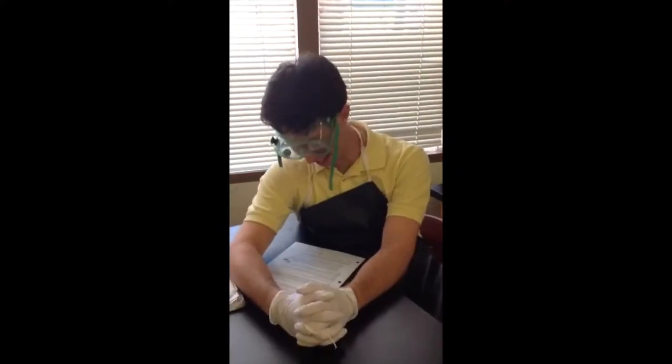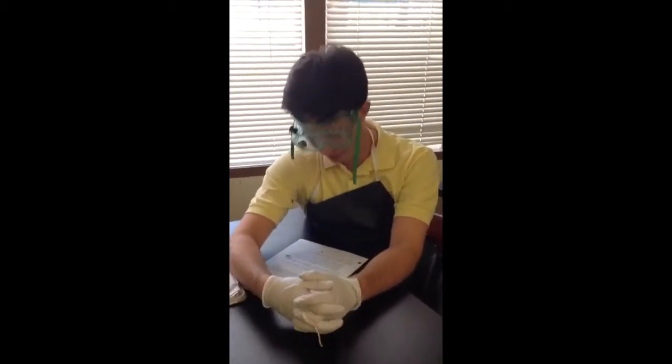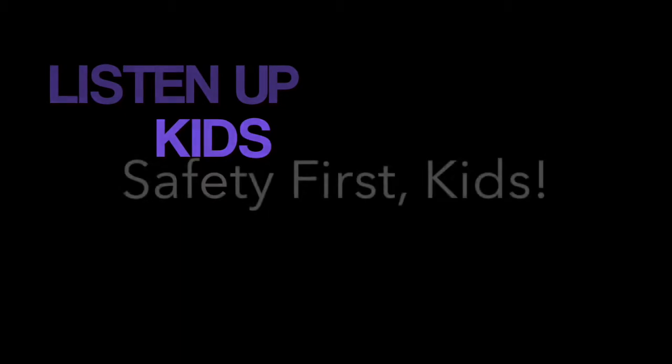The goal of this lab is to determine the unknown concentrations, the pH, and the pOH of 3 different acids by titration. Titration is the controlled addition and measurement of a known solution to an unknown solution until the reaction reaches its equivalence point, which is when the two solutions are in chemically equivalent amounts. The equivalence point can be determined by an indicator called phenolphthalein. The indicator will change colors, and this point in the titration is known as the endpoint of the indicator.